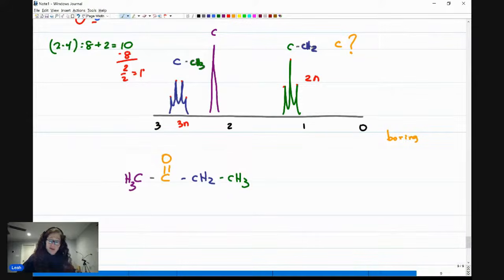And so our final molecule. So Joshua, again, based on your question before, how do we know if nothing is given? We kind of figured it out backwards, but we came up with our structure. So we have 1, 2, 3, 4 carbons on the molecule, with a carbonyl sitting right over there at position number 2.